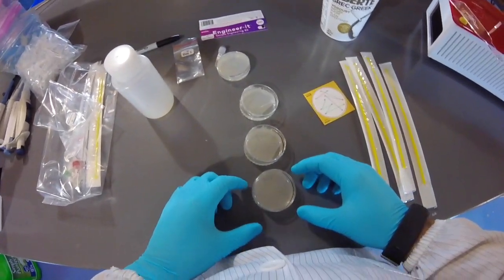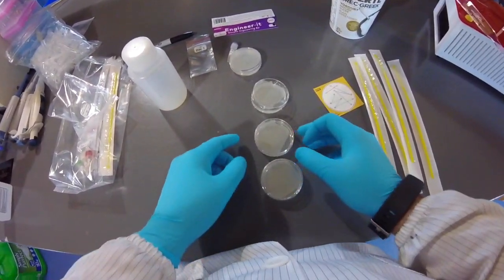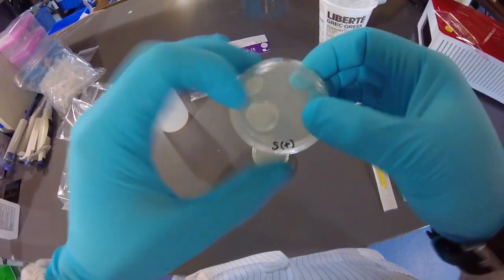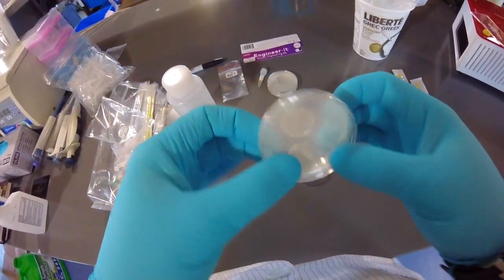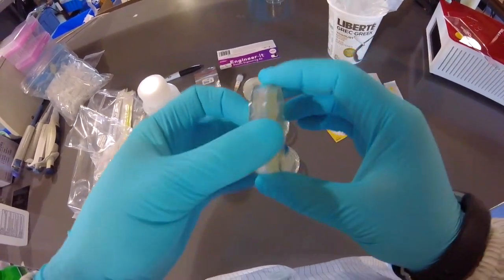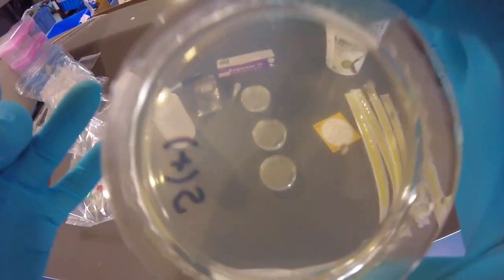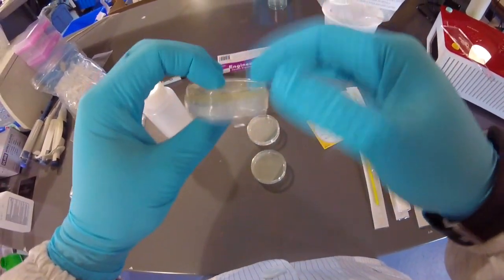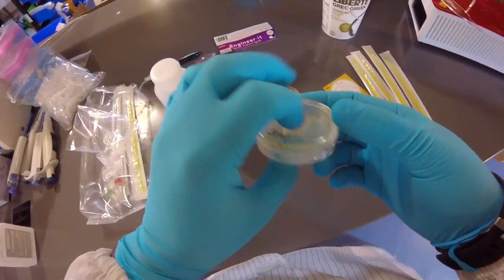Alright, so we're back. It's been about 15-20 minutes. If we have a look at these, they become a little bit not as clear as before, but they're very clear. So these plates are well done. If you flip them, nothing's going to fall out.